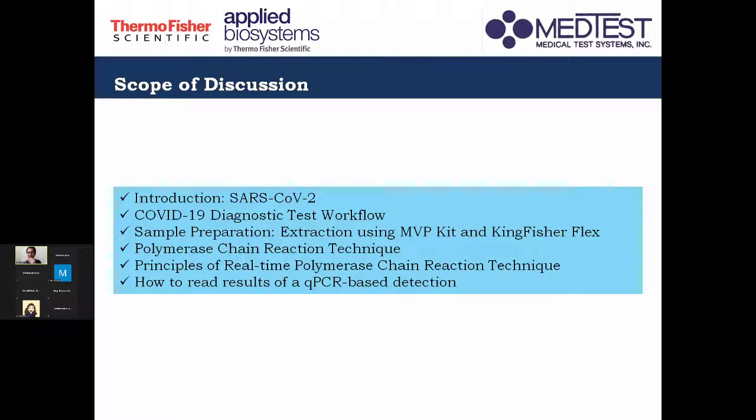And then after that, we'll go with the principles of real-time polymerase chain reaction or qPCR or RPCR. So real-time PCR, kung anong difference niya dun sa the conventional polymerase chain reaction technique. And then lastly, how to read the results of a real-time PCR instrument. So let's start.